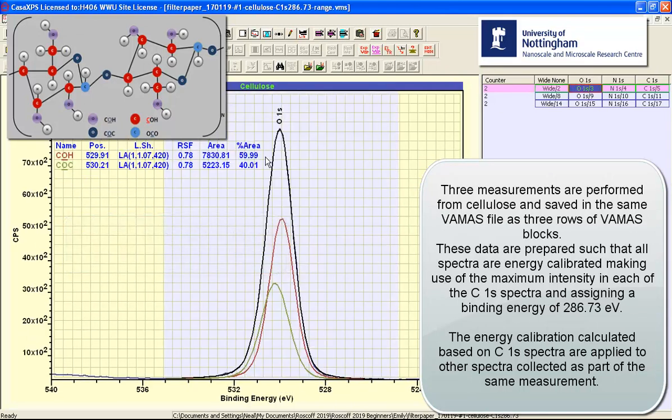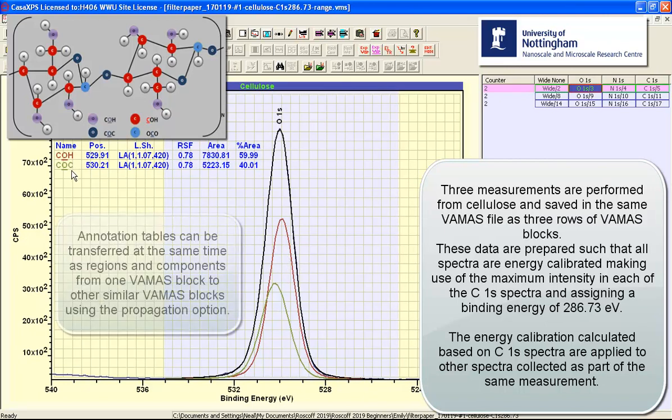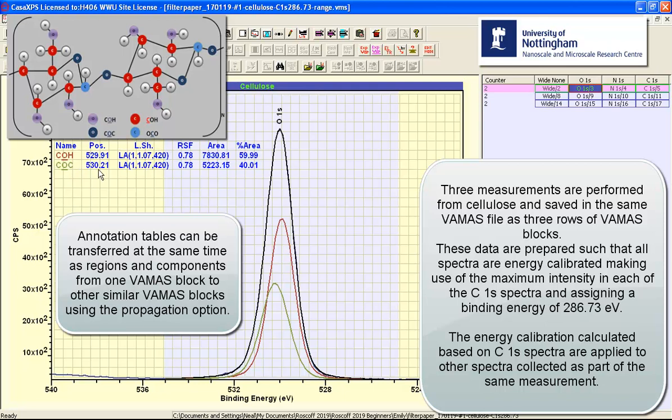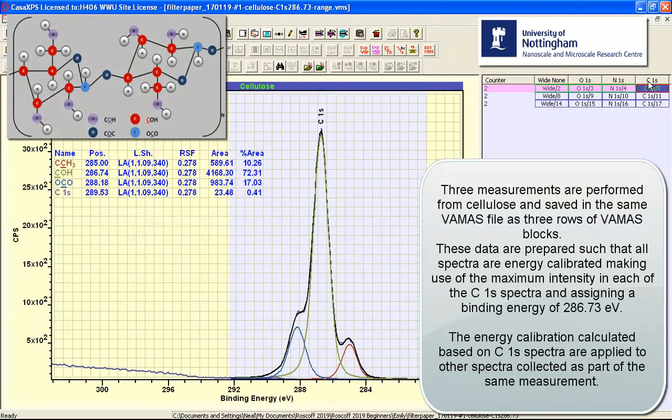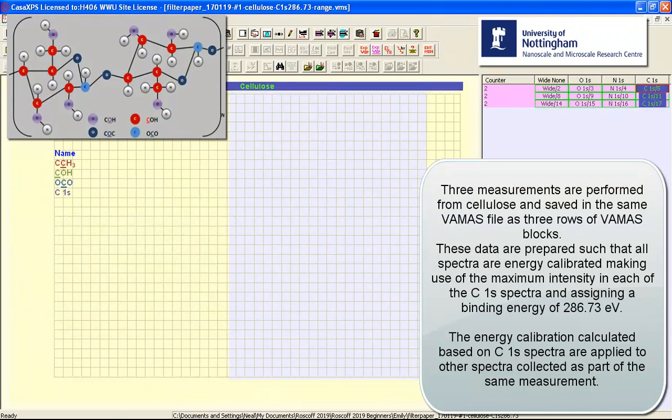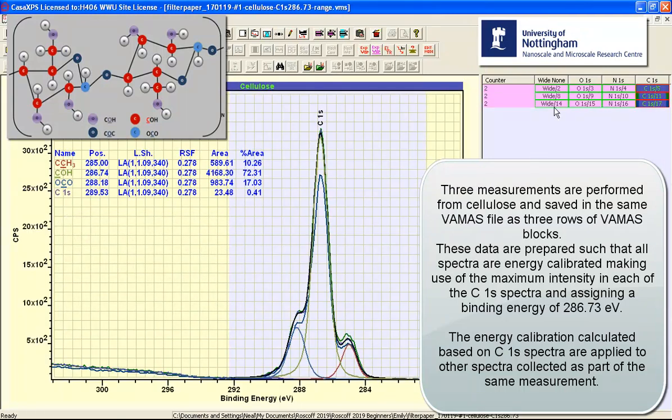The oxygen has a pair of peaks that represent the two different bond states for oxygen within this cellulose material, and also the carbon. In addition, these data have all been calibrated in terms of energy using the maximum intensity within the carbon 1s interval. So all of these data are energy calibrated so that we have the CO bond of C1s at 286.7.